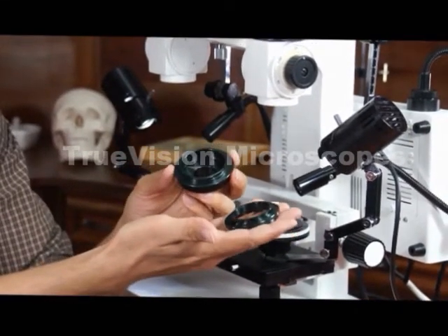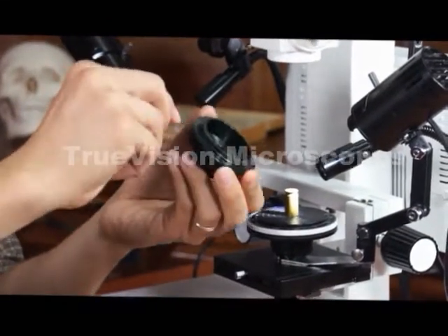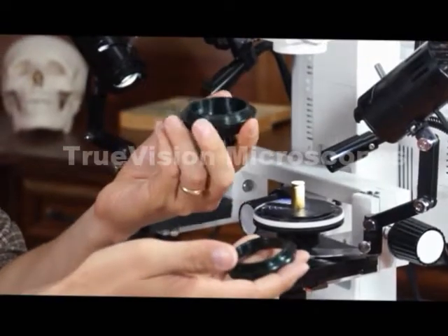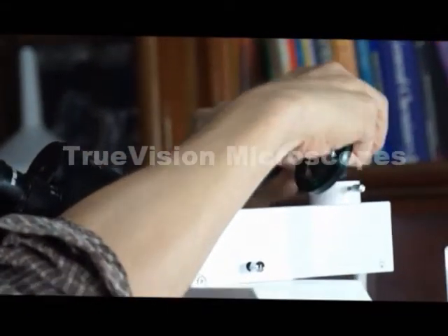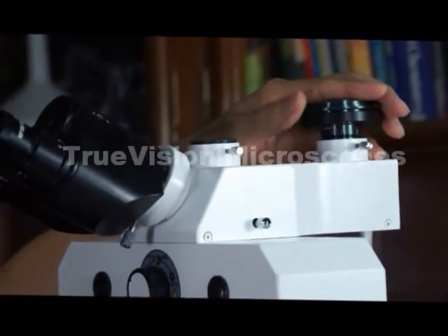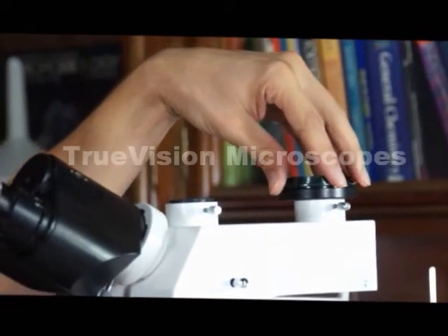If you've got a Nikon camera, you're going to have to have a Nikon T adapter. So you would take this one off and replace it with the Nikon one, or a Canon, or whatever. At this point, the body of the camera will lock directly to the top.